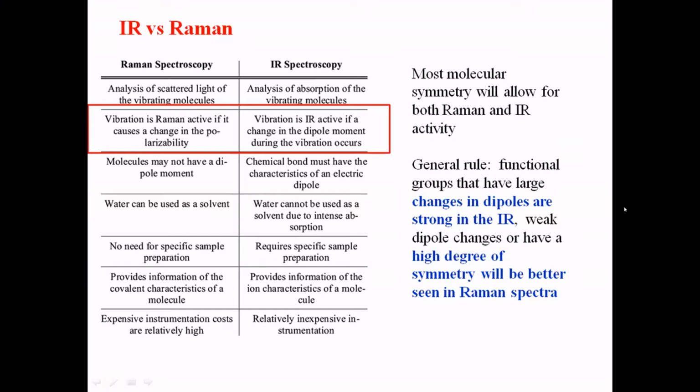IR only absorbs at IR wavelength energy, from the vibration level. So it fails to give the exact structure using IR. To address that kind of issue, that means materials that suffer from strong symmetry elements, you can switch to Raman. Raman is highly helpful to understand the structure, even though they have a complex symmetry.